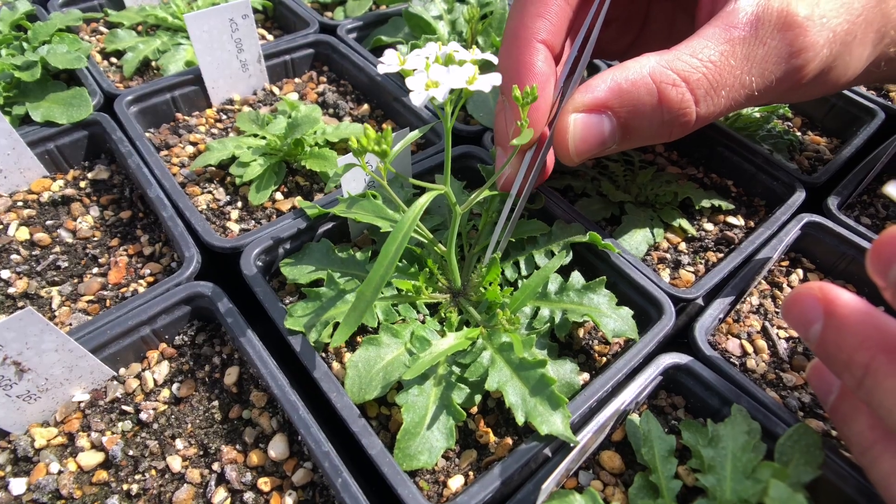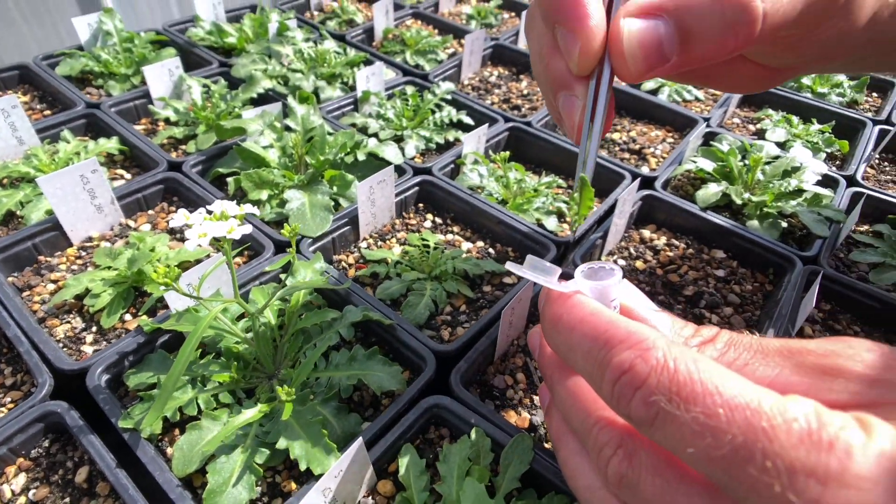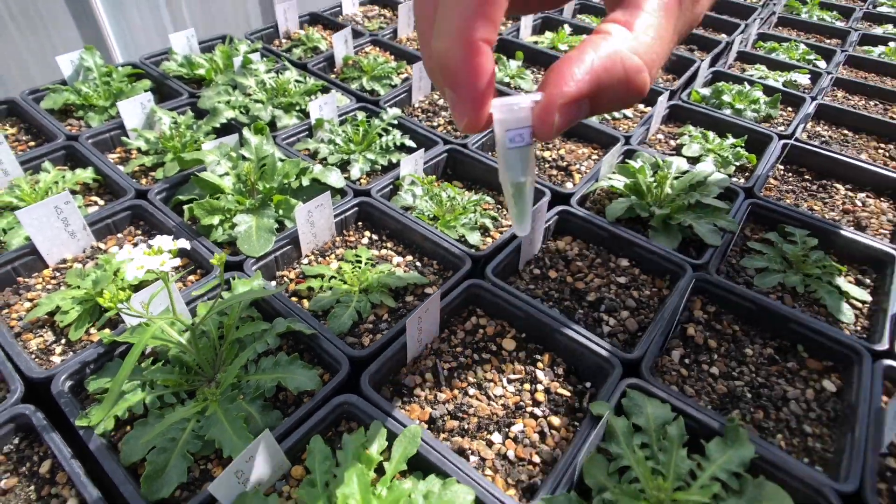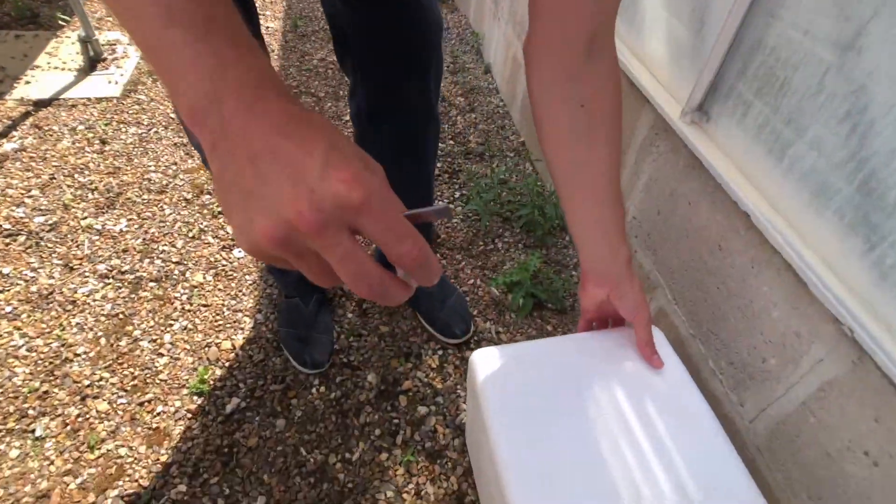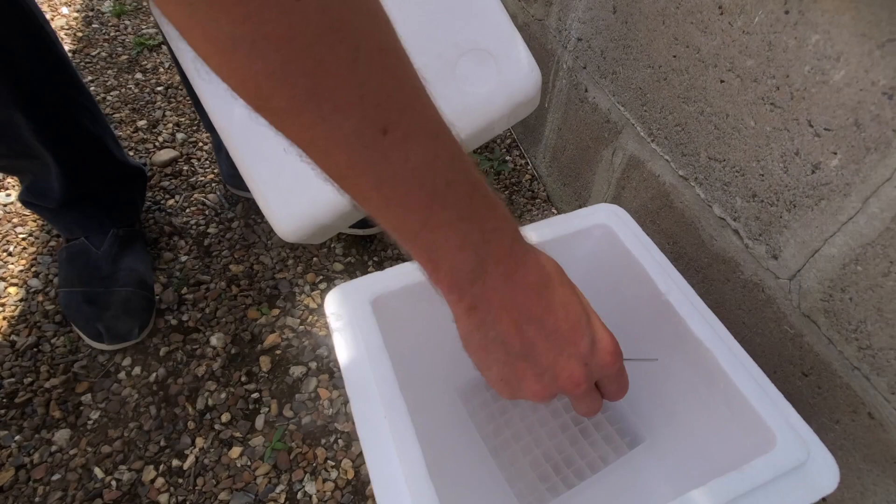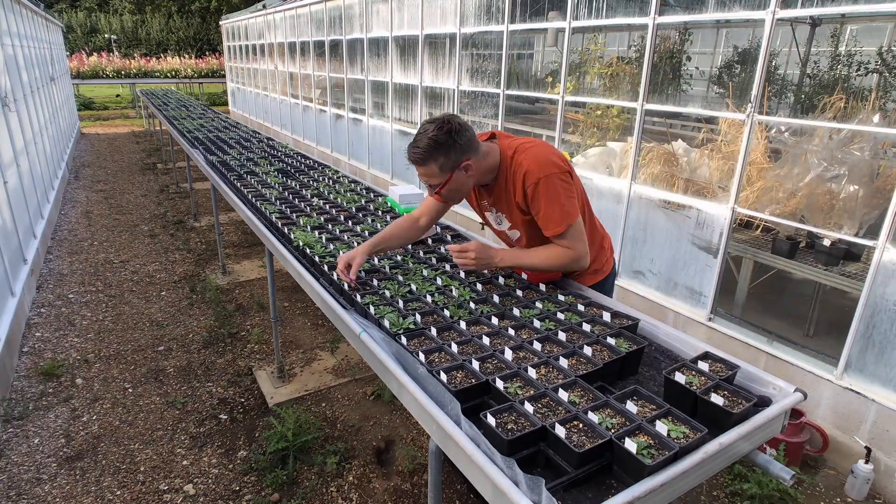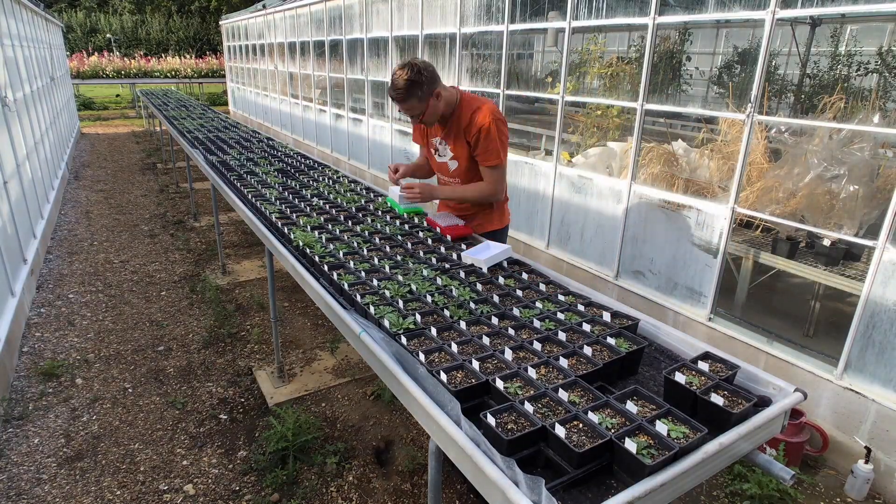To extract DNA from leaves we need to sample young leaves, put them into labelled tubes and shock freeze them in liquid nitrogen. And we sample all of the 1,000 individual plants.